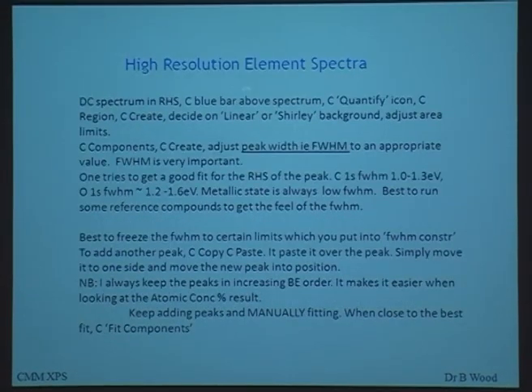And for the high resolution, this is very important, this peak width. That is the full width half maximum. That's very important. I've seen a lot of rubbish fitting in the literature, you know, a carbon spectrum with 9 peaks, and it's all a bit wishful thinking.